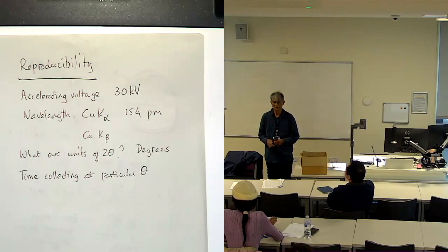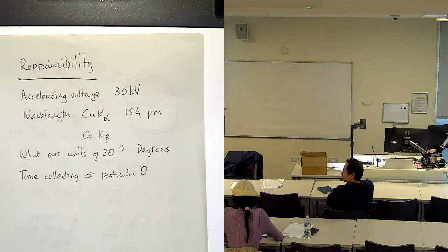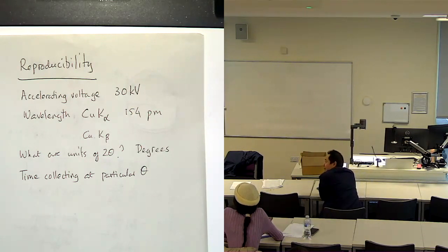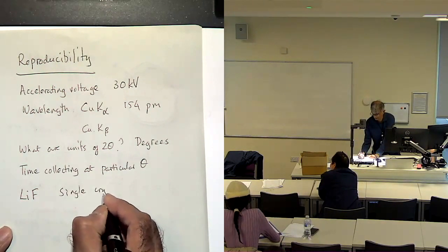High fluoride environment. Okay, and what was the crucial difference apart from their chemical compositions? The crystal structure are different. One is cubic. And what else? That's absolutely right, but what else was the difference between the two? One is single crystal, the other is polycrystal. Excellent. So we had lithium fluoride, single crystal, okay, so that's quite important.